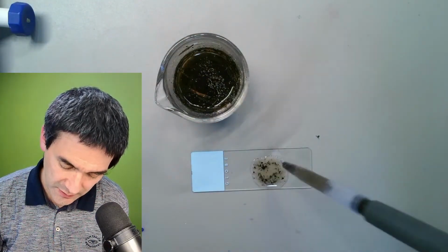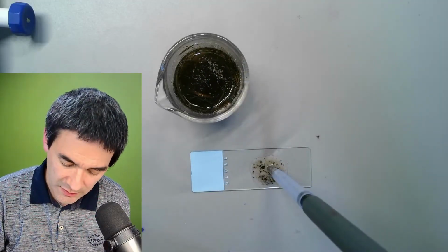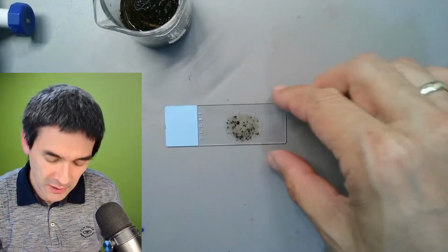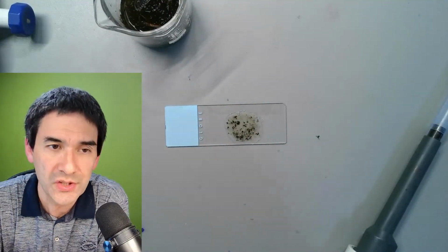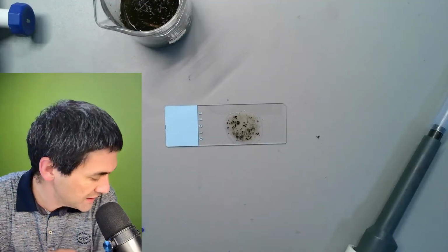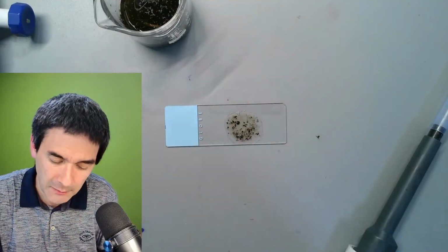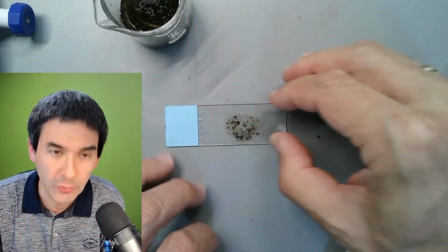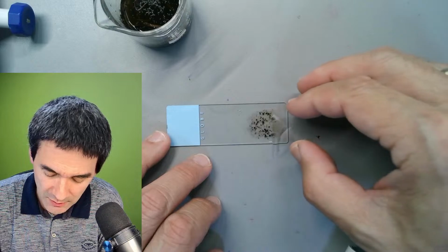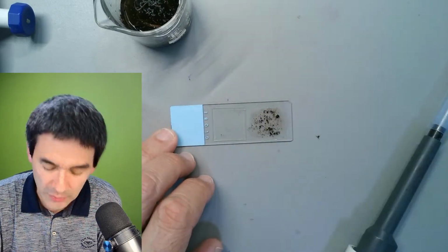If I were to place a microscope cover glass on here, it's not going to be flat because there is simply too much thick solid material on here. So my suggestion is always the following: either you only pick up the liquid, or you take a cover glass, push it to the side like this, and go like that.